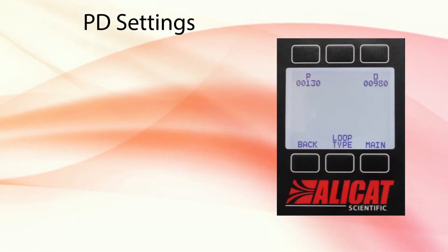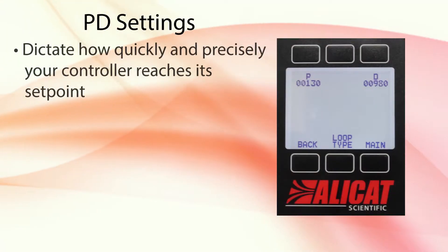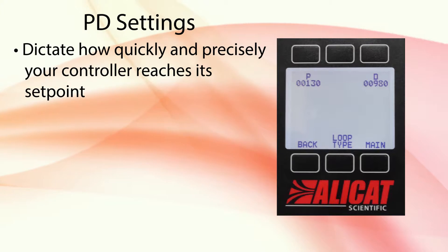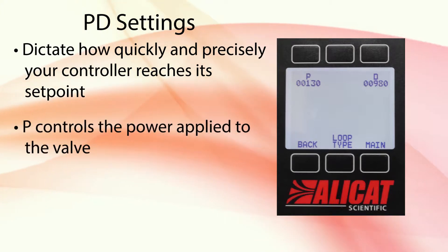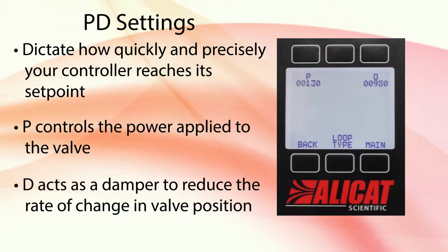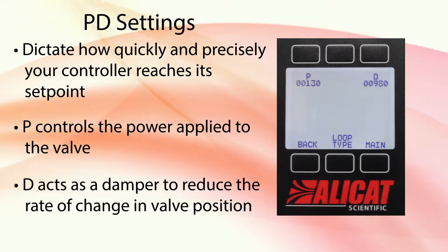The P-D settings for your AlleyCat controller valve dictate how quickly and precisely your controller reaches its setpoint, with P controlling the power applied to the valve and D acting as a damper so as to not overshoot your setpoint.